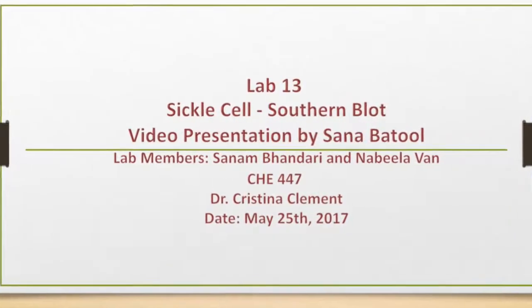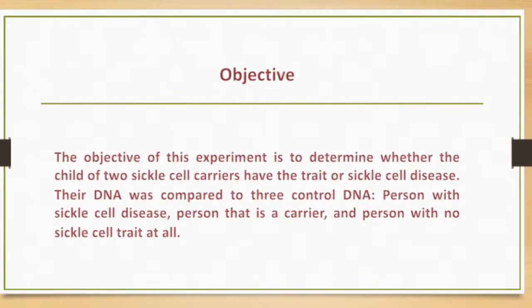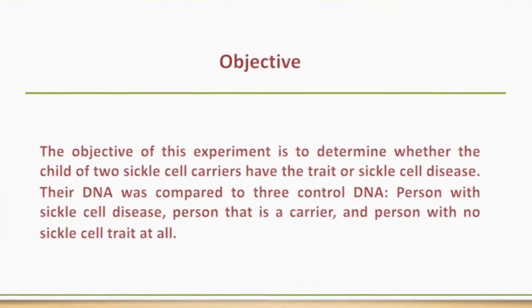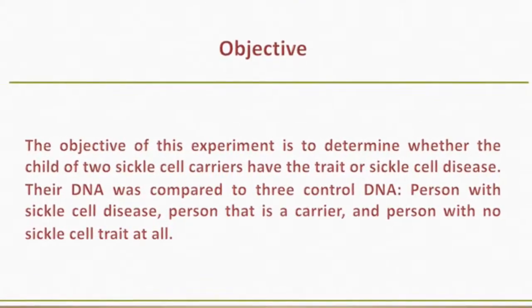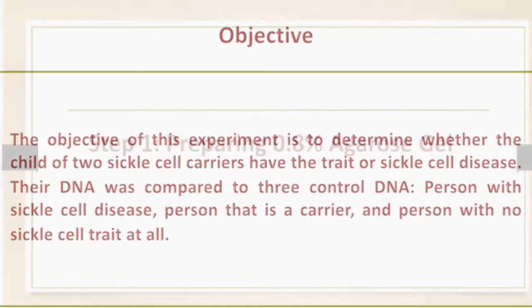Hello everyone, today's lab is sickle cell Southern blot. The objective of this experiment is to determine whether the child of two sickle cell carriers has the trait or sickle cell disease. Their DNA was compared to three control DNA: a person with sickle cell disease, a person that is a carrier, and a person with no sickle cell trait at all.